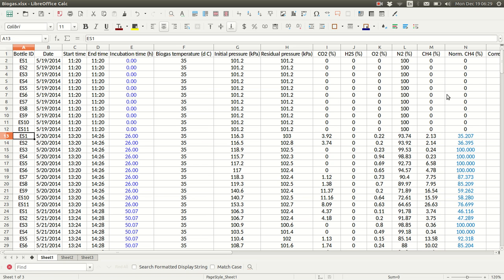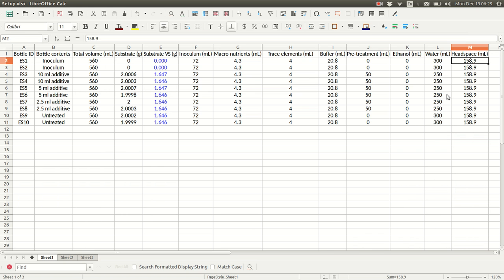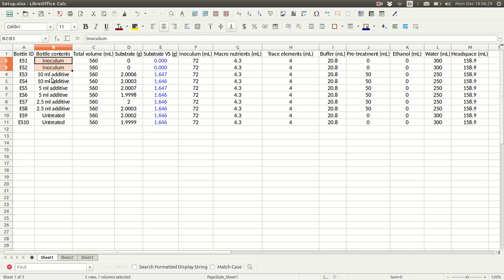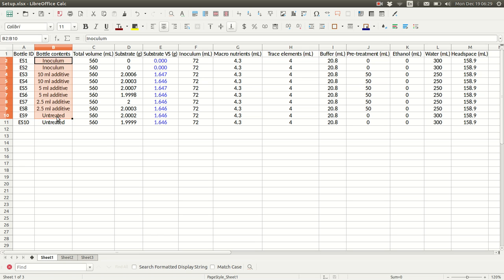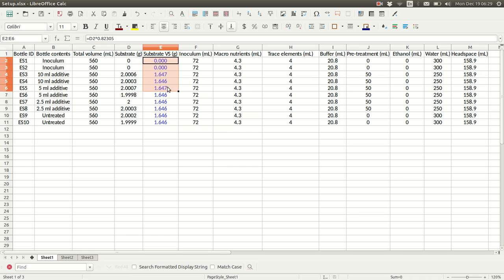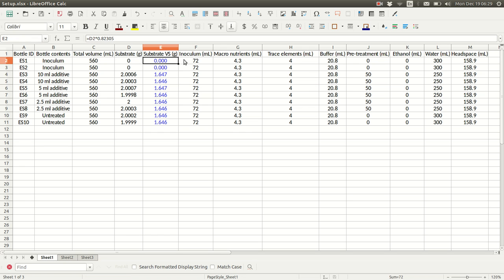So the second file we need, I've called it setup here, and it has the data that are necessary for grouping bottles, so we can see the ES1 and ES2 are both inoculum-only bottles. This column that contains the unique bottle identification code has to have the same name as the column with the same code in our biogas file. So in addition to a description of what's in each bottle for grouping, we need to know how much substrate mass there is if we want to normalize by substrate mass, and here we're interested in BMP expressed per gram VS, or volatile solids, so that's how we're defining substrate mass.